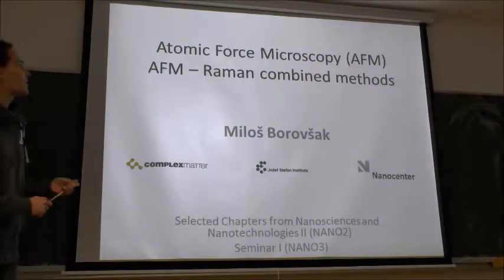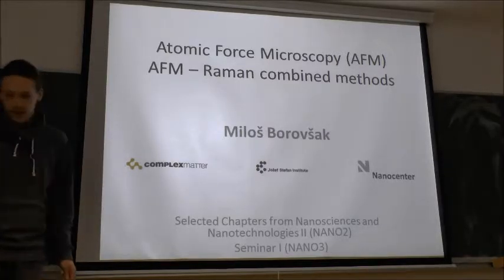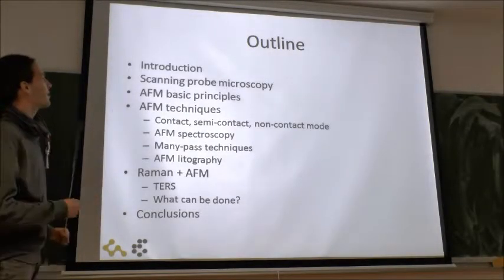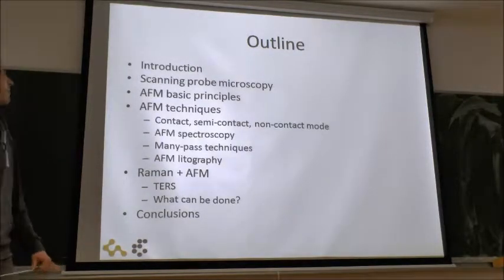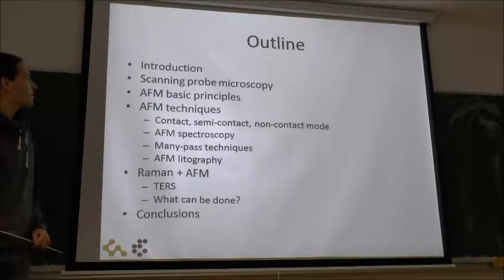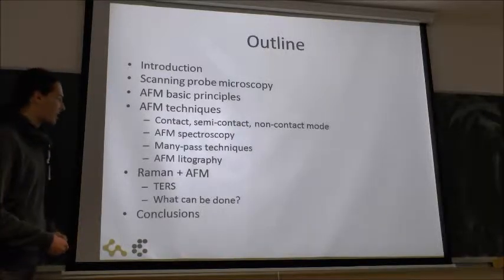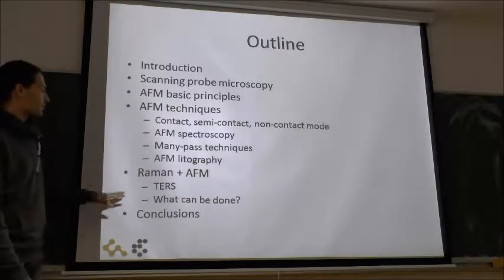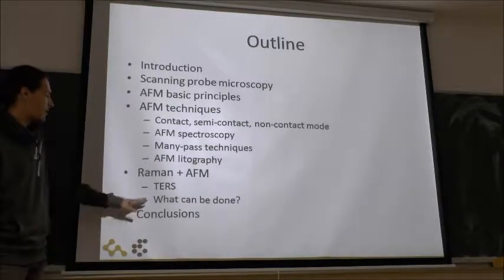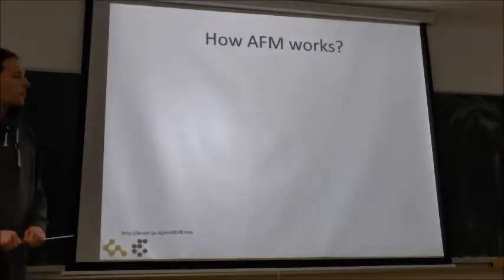I'm Milos, and I will present you the atomic force microscopy and the combined techniques of the AFM and Raman. I don't know how familiar you are with the AFM, but here's the outline. I will do some introduction to the AFM, for those who are not familiar, some principles. Then I will say something about scanning probe microscopy, the AFM basics and techniques, and after that I will come to the combination of Raman and AFM and some special techniques, and what we can do with the system.